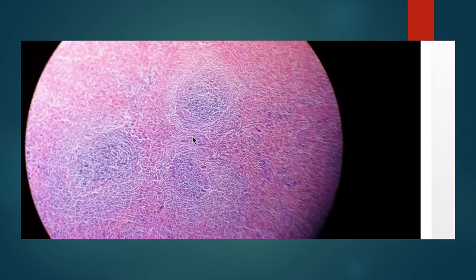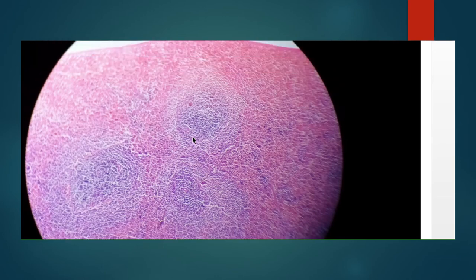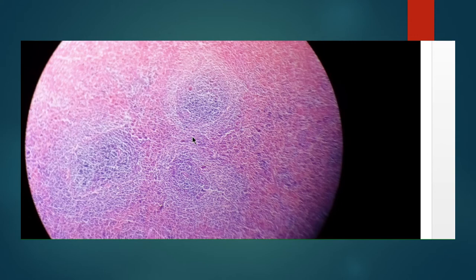Now, we have come to another lymphatic organ. So, what is this? You may think it is a lymph node, but it is not a lymph node. Then, how to differentiate it? We have already seen lymph node, then thymus, and palatine tonsil. So, the leftover one is the spleen. So, how to identify the spleen?